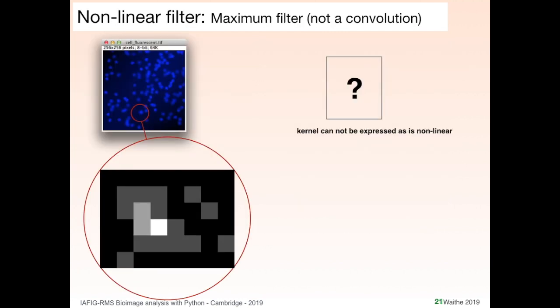And to understand it, we have to understand the building block of all foci detection algorithms, which is something called the maximum filter. So we've done some things about filters. If you're doing convolution, that is a linear filter. That's more or less the definition of a linear filter. This is a non-linear filter, which means it reacts differently depending on where it is. You can't go backwards with a non-linear filter. It's a one-way process. But don't worry so much about that today.